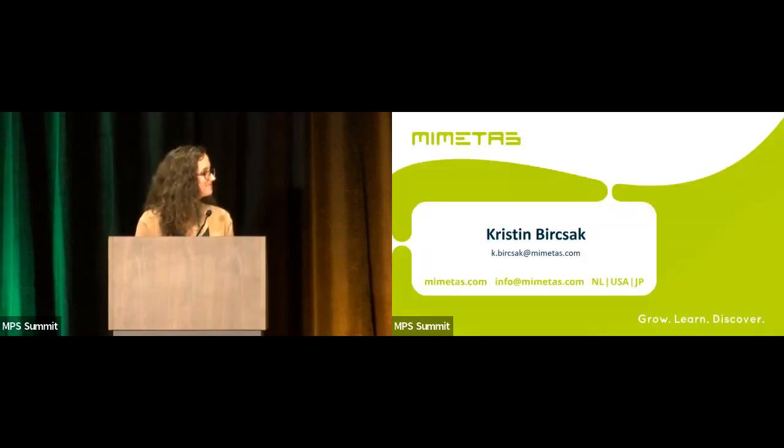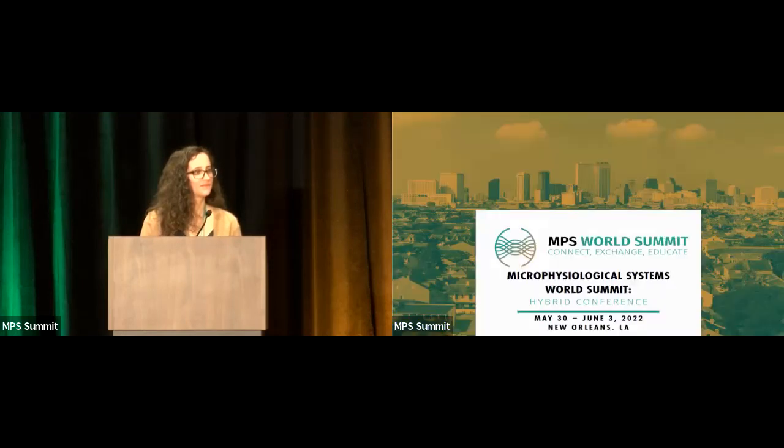Thanks, Chris. I think we have time for one or two questions. Thank you for your talk. This is Ramin from Kyoto University. I was going to ask if you have investigated formation of a bilayer of epithelial and endothelial cells, until you showed the last picture. I was wondering if you could make this bilayer more intimate, like culturing HUVEC right in contact with RPTEC. That's question one. Question two, the difference between your OAT1 overexpressing cells and the immortalized one. How much is the difference in the amount of OAT1 actually?